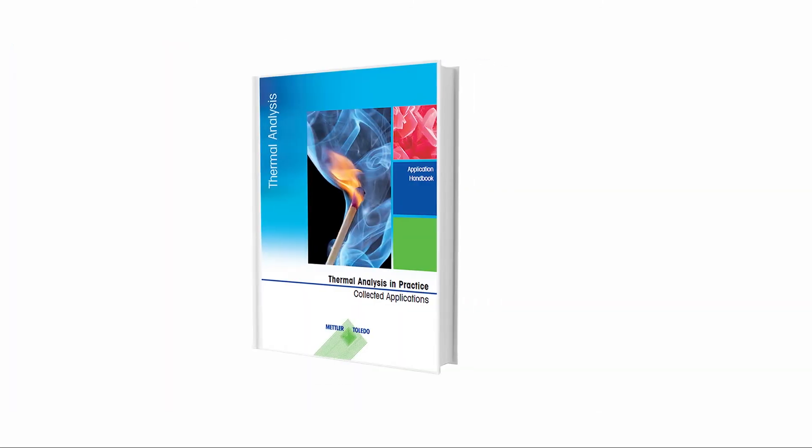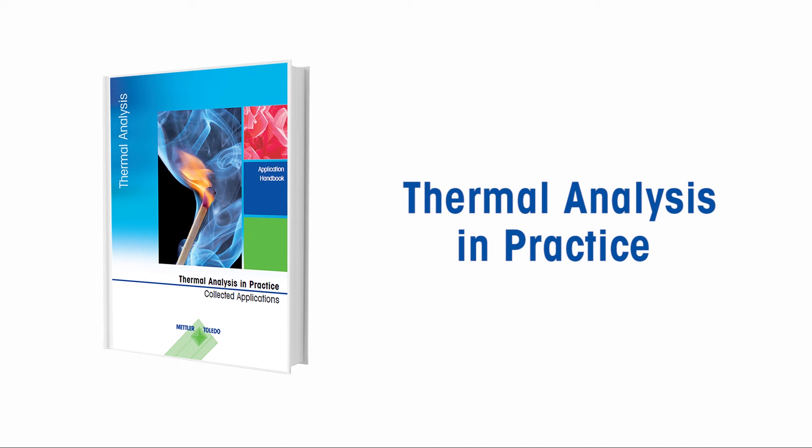Additional tips and hints can be found in Chapter 10.3 of Thermal Analysis in Practice.